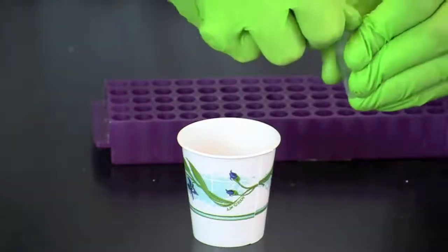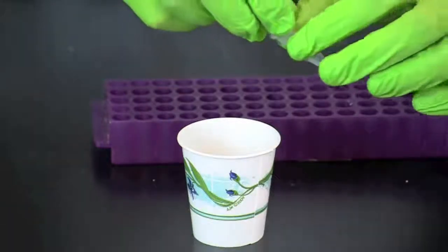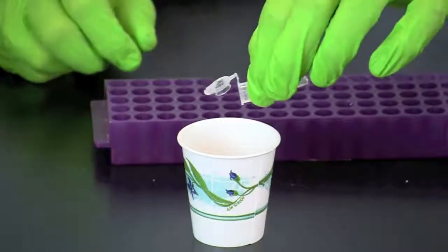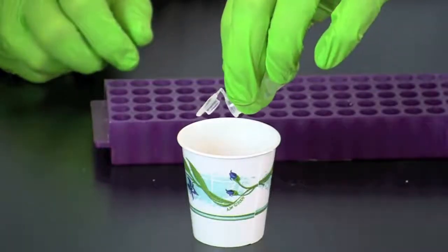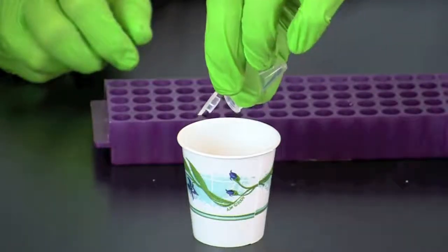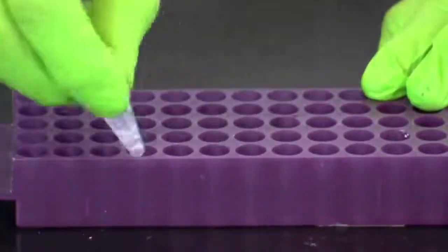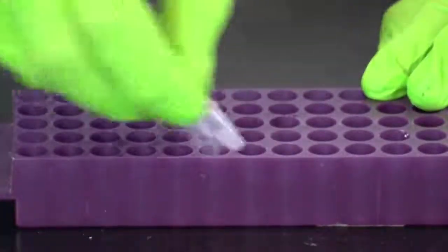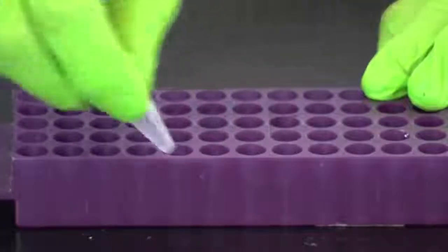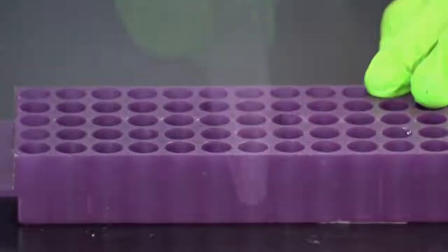After pelleting the cells, pour off the saline solution. Be careful not to lose the pellet. A small amount of saline should remain at the bottom of the tube. Re-suspend the pellet by rubbing the tube over a microtube rack to break up the clumps. Vortexing or flicking the tube can also be used so that no clumps remain.